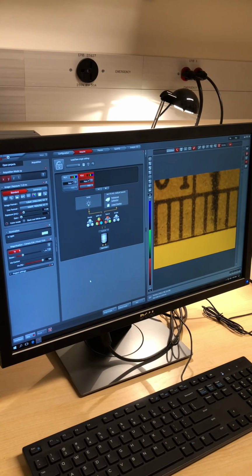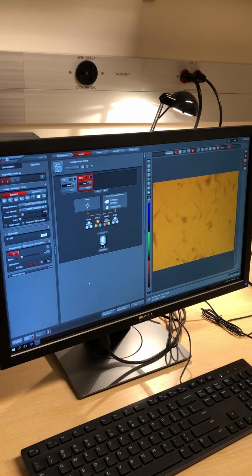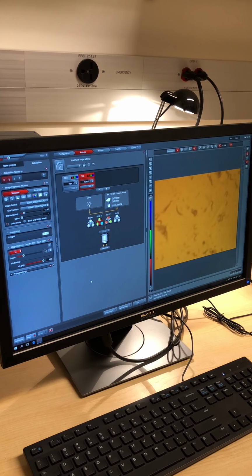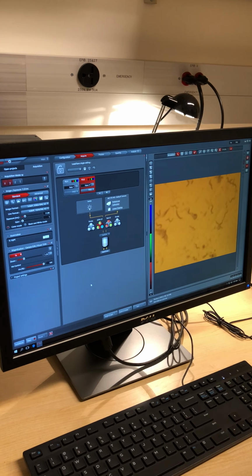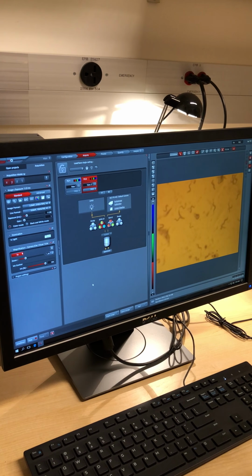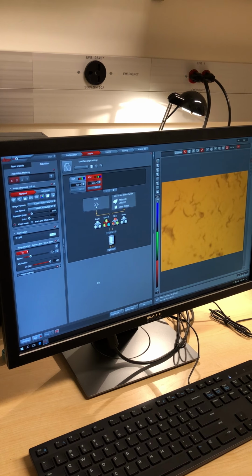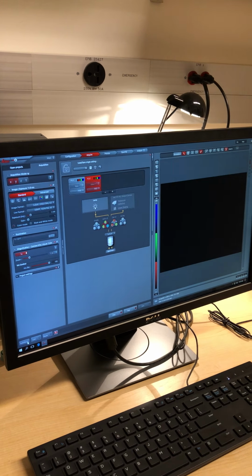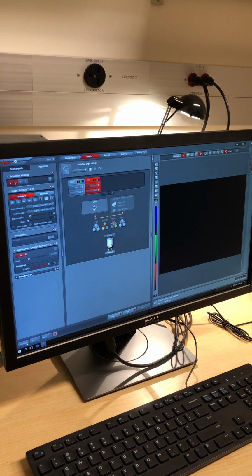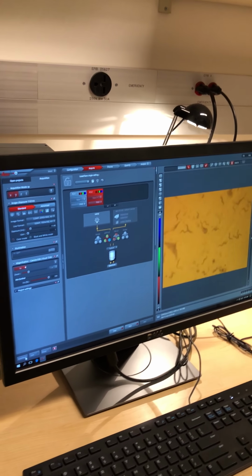It's going to look through the Z-stack, and then at each XY position, it's going to try and assign the correct pixel that's in focus through the Z-stack. So on the left side it may be the third Z-stack, on the right it may be the seventh. It depends on where you're focusing. For example, if you click out of focus, you'll see that the light intensity is something you play with, it's manual. I'm going to get into a little detail there.